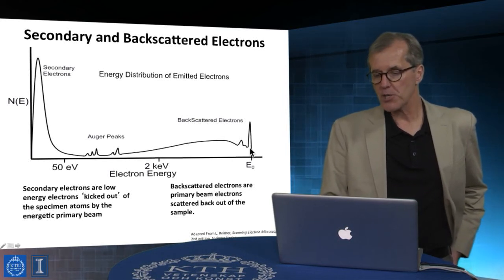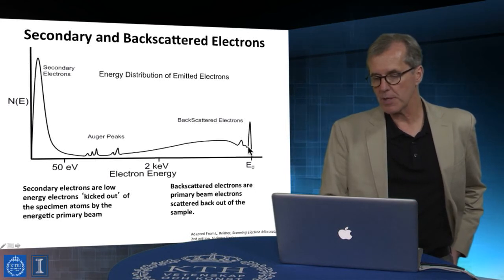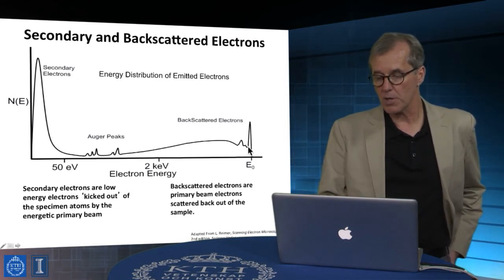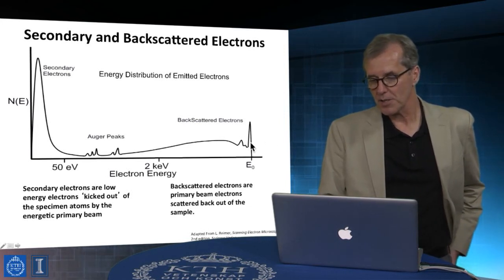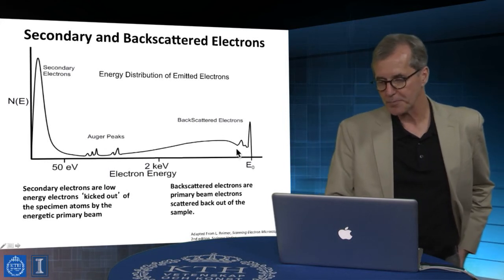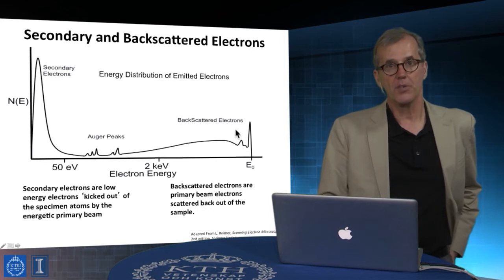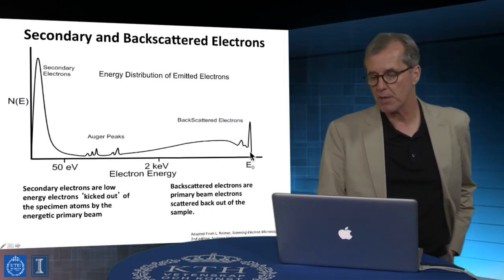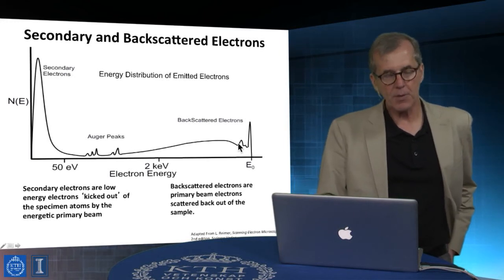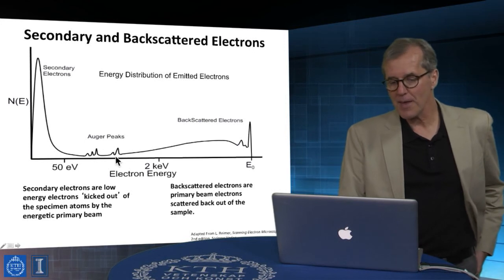But some fraction will have quasi-elastic scattering, which means there's energy lost, but somewhat non-discrete in its profile. We'll see discrete electron energy loss features. This is the basis of what's called EELS, electron energy loss spectroscopy, if we were to energy analyze them. Typically in an SEM, we do not. A broad hump coming off of that.